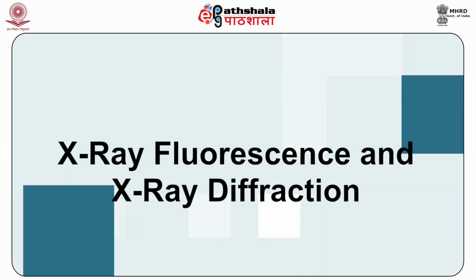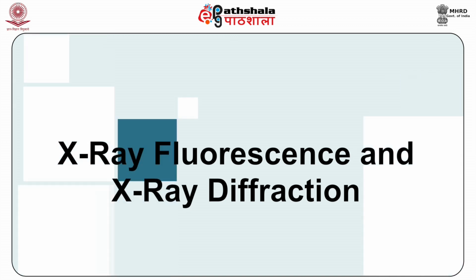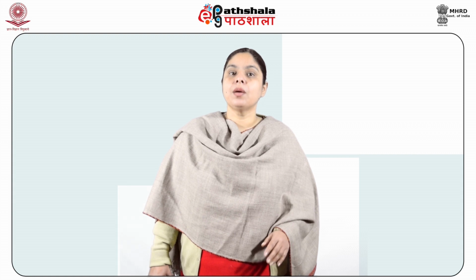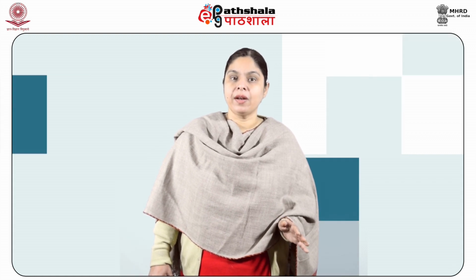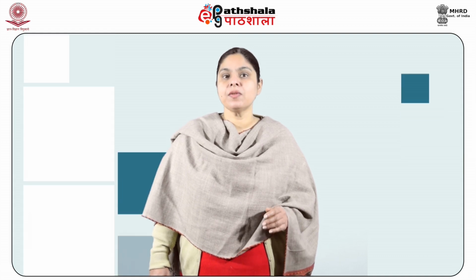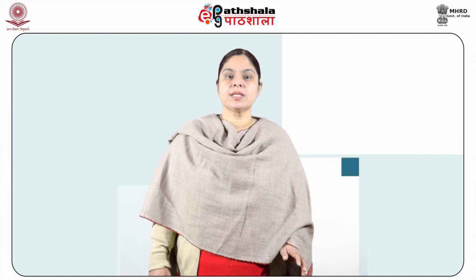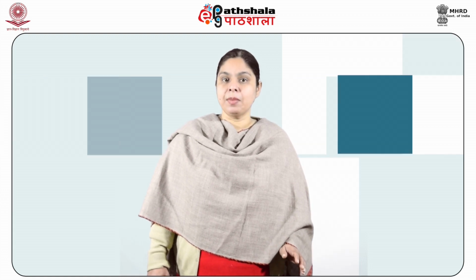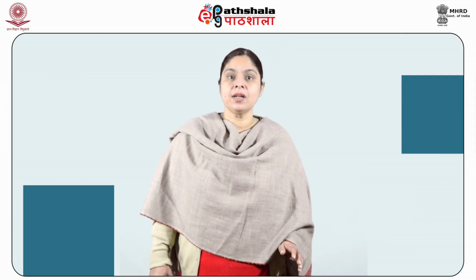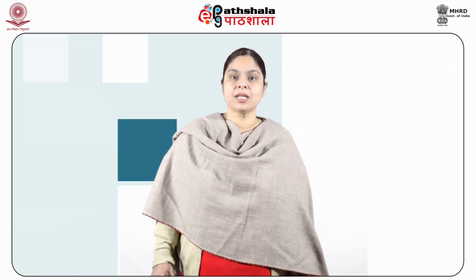Now, coming to the last techniques, X-ray fluorescence and X-ray diffraction techniques. Both are very famous non-destructive techniques. Because of the penetration depth of the primary X-rays, X-ray fluorescence analysis yields elemental data from several layers of a multi-layered paint fragment simultaneously.